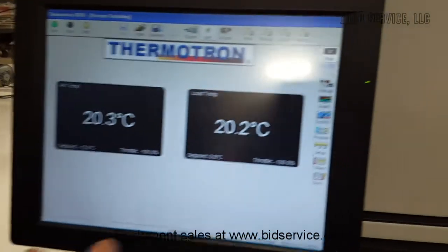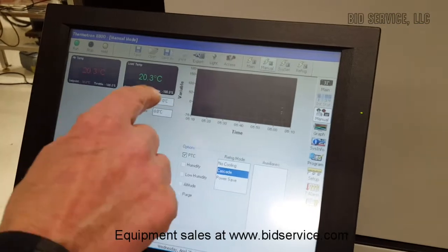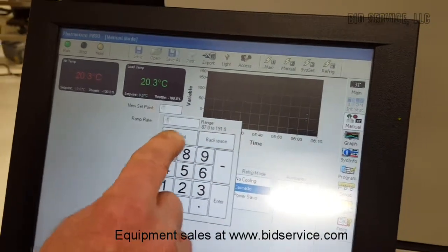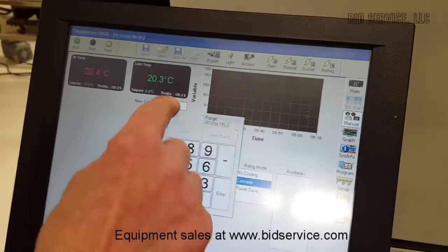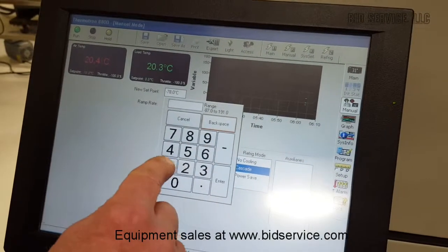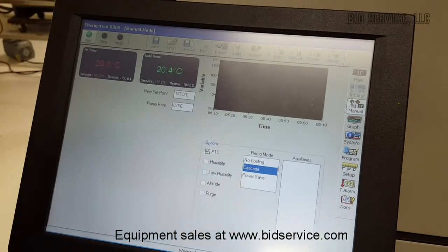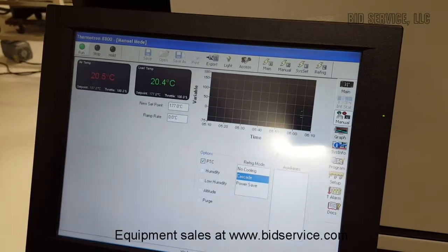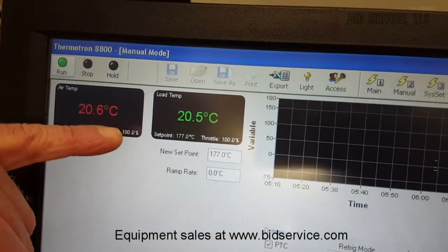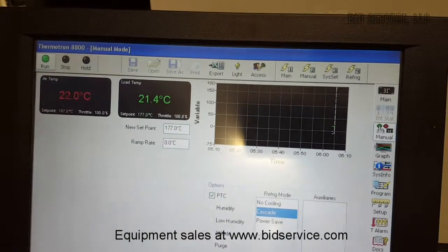Just to get started, I'm going to go into manual mode. Here's where you can change your set point — it's very simple. You can either put in a minus value or a positive value. We're going to go up to 177 here. We're going to enter, and we're going to run.